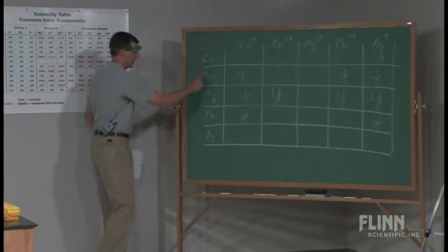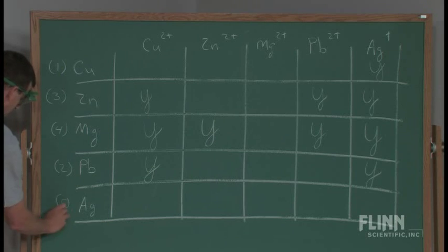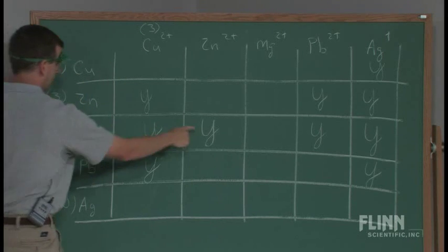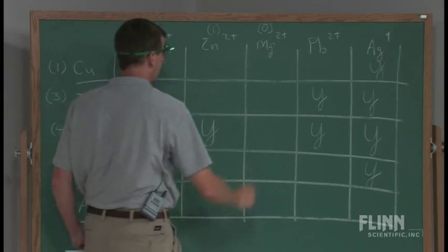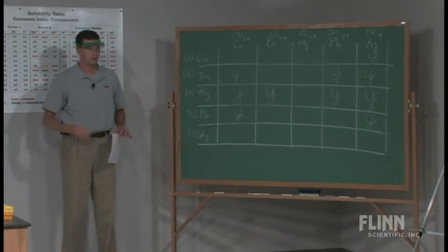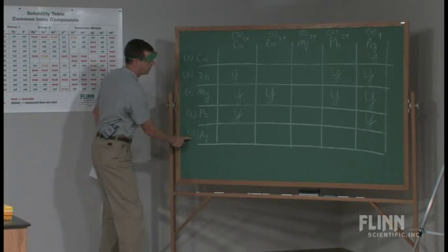What I really like about this is we're going to go down the metals first. Copper reacted with one thing. Zinc reacted with three things. Magnesium metal reacted with four ions. Lead reacted with two ions. Silver didn't react at all. Looking at our ions across the top: copper reacted with three metals. Zinc ions only reacted with one other metal. Magnesium didn't react with any of our metals. Lead reacted with two of our metals. And silver reacted with four of our metals.